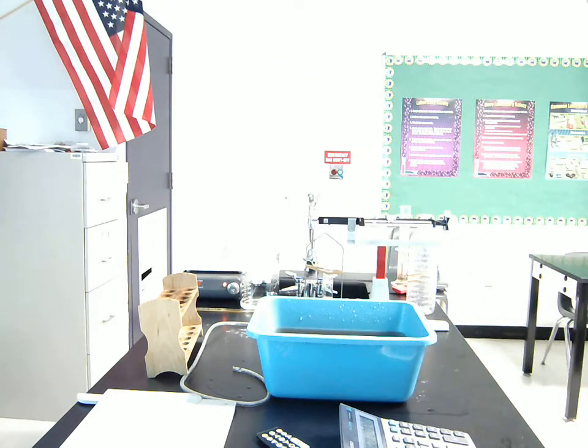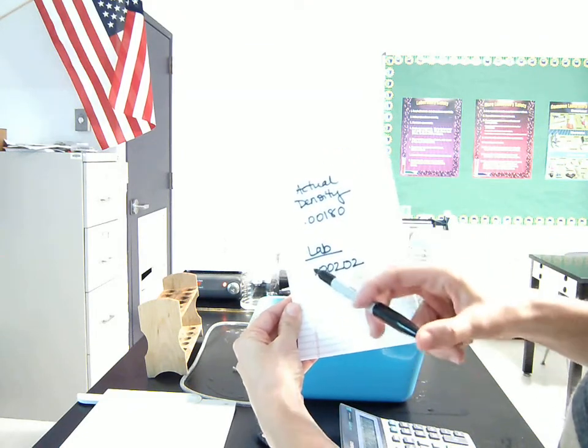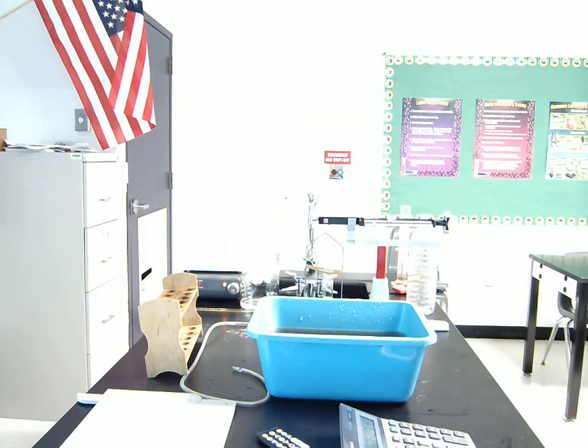Because if we're going to use significant digits, we should put a 0 there. So you can see 0.00180, 0.00202. Not too bad. Not too bad in terms of our measurements.